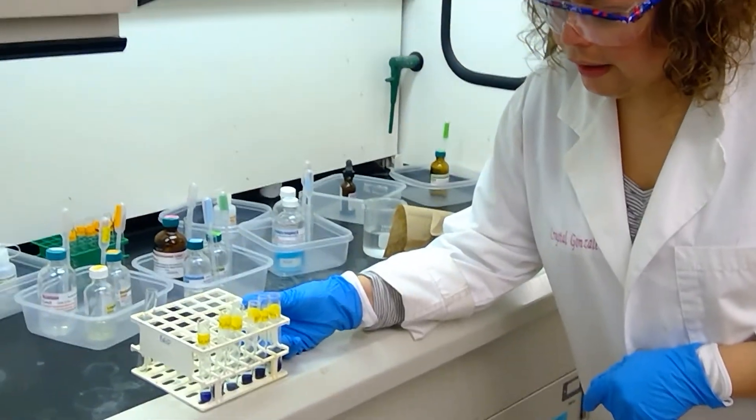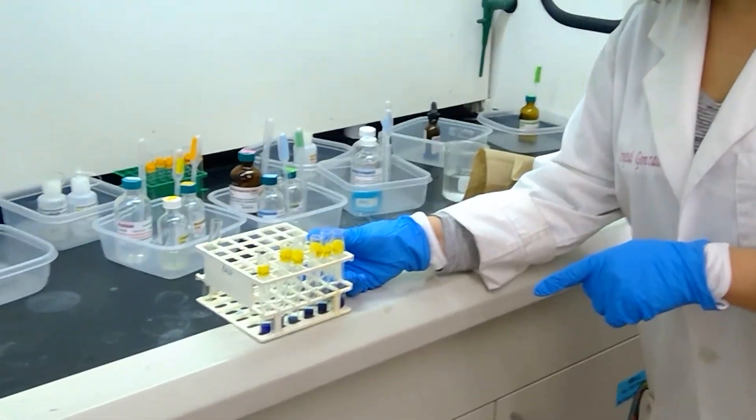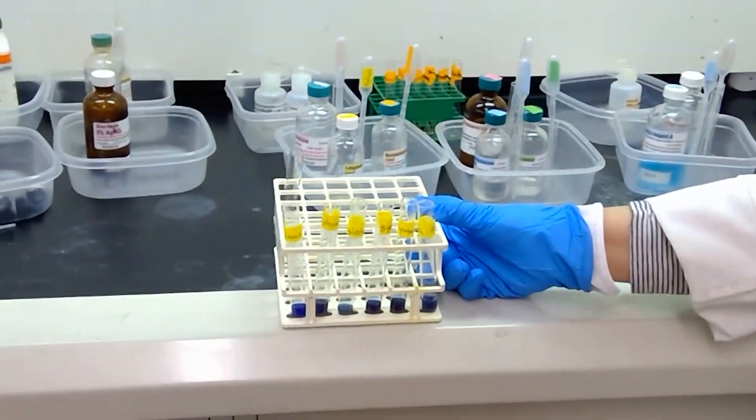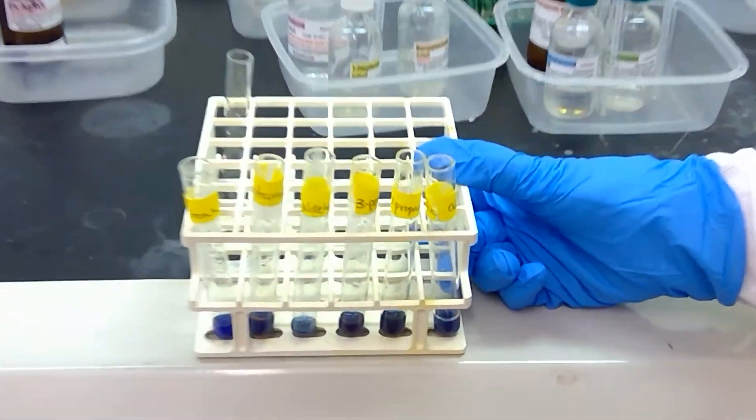We have boiled the samples from the Fehling test for 10 minutes and removed them from the heat, and I'm going to bring in the camera pretty close so that you can see the results of all the different samples.